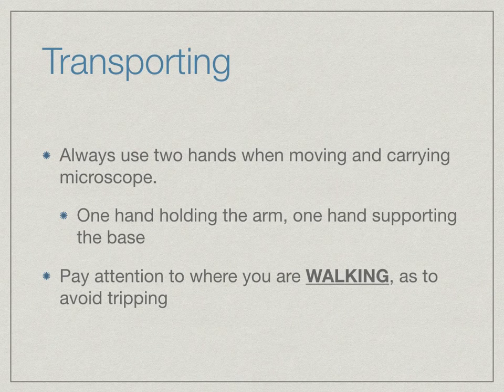When you're transporting the microscope, make sure you always use two hands when you are moving and carrying it. One hand belongs on the arm, the other hand is supporting the base of the microscope. The hand supporting the base is palm up with the base resting on that palm, which is going to support a majority of the weight of the microscope.